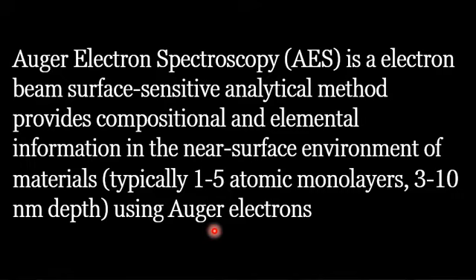So in simple words, Auger electron spectroscopy is an electron beam surface sensitive technique.